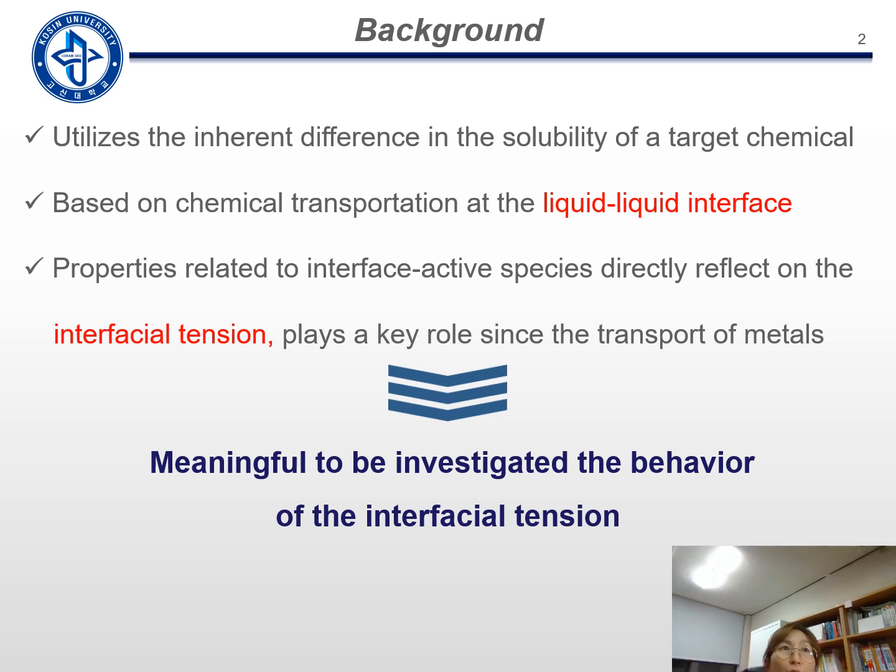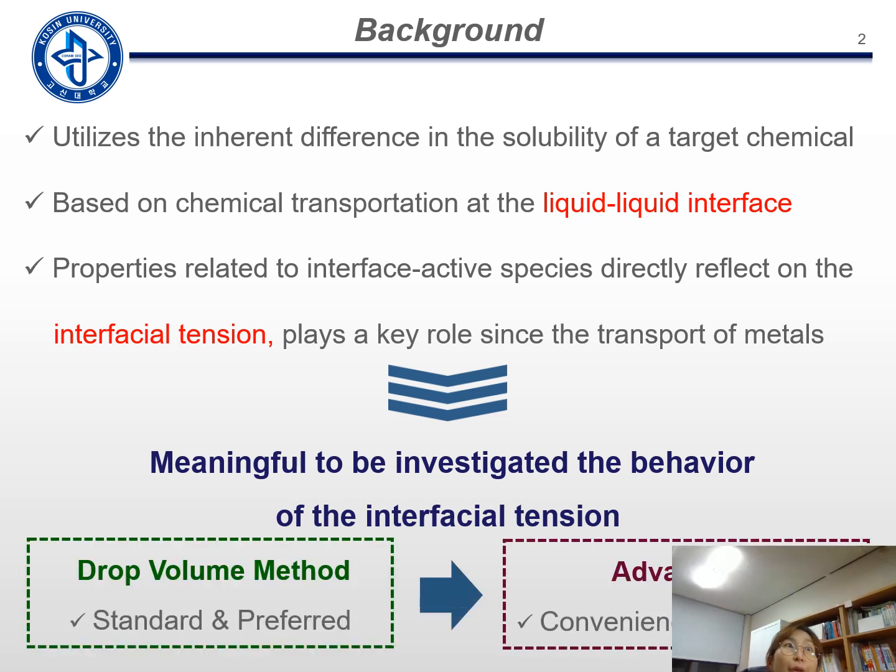So, how can we investigate interfacial tension? The droplet method is a standard method for measurement of interfacial tension due to its convenience and simplicity of handling.